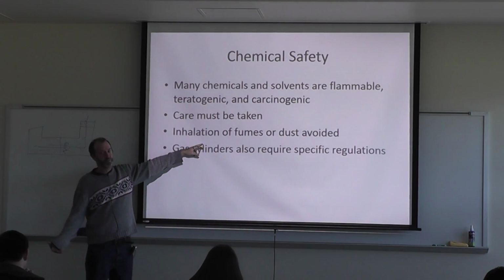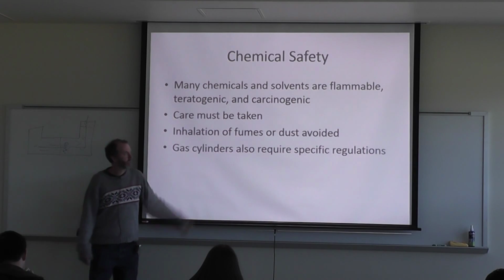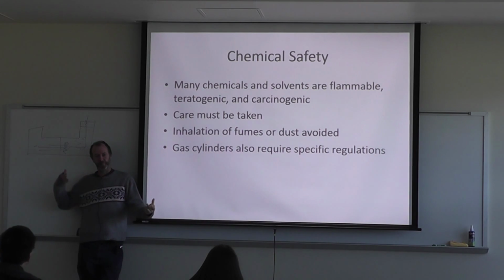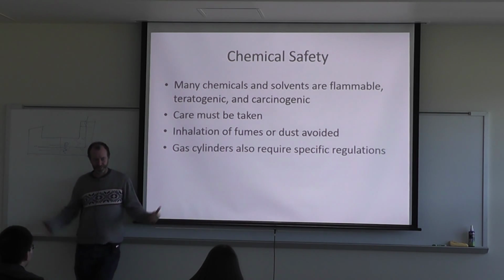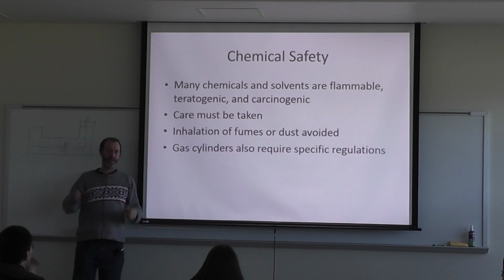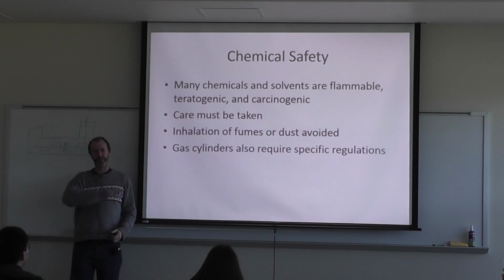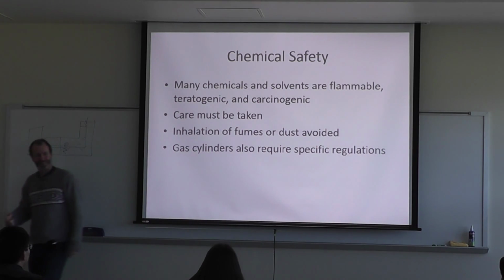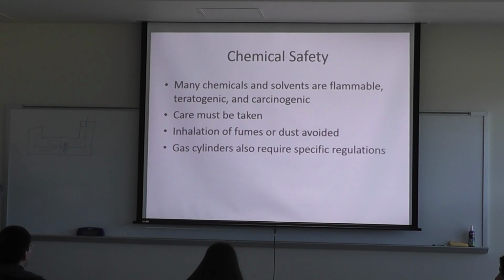Care has to be taken when you're working with chemicals. Inhalation of fumes or dust has to be avoided. Gas cylinders also require specific regulations. Who's seen that Mythbusters where they chop the ends off the gas canisters? It turns them into rockets. Yes, they fly them through concrete walls. So that's a safety issue with gas cylinders. They have to be bolted down somewhere because they topple over if they don't have their cap on, with just the regulator or nothing on them but the valve. If that valve gets knocked off, it turns into a huge rocket that can kill you. So yeah, they're no joke.